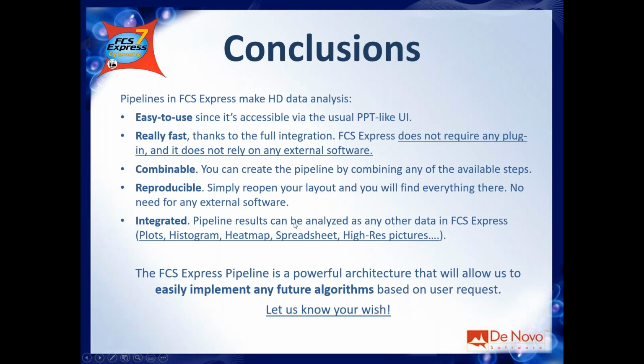Let me just summarize. With FCS Express, now you have this amazing tool, which is the pipeline. With the pipeline, when you want to run high-dimensional data analysis, it's really easy to use because it's in the FCS Express PowerPoint-like user interface. You have drag and drop, you can check or uncheck, you have drop-down menus. It's a very user-friendly interface. Then it's really fast, because we are coding every algorithm directly in FCS Express. We are not using any external software nor plugin. It's combinable, it's reproducible, it's integrated.